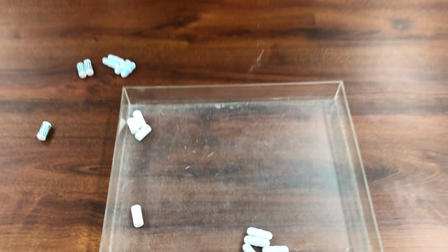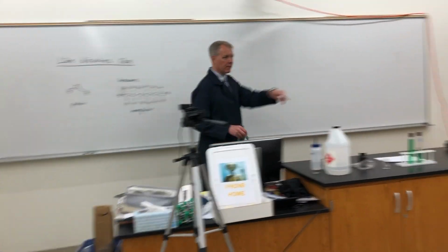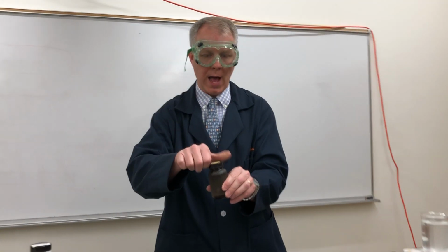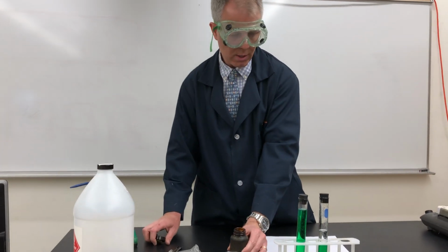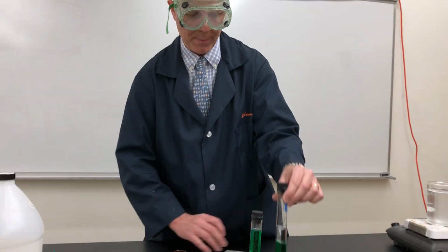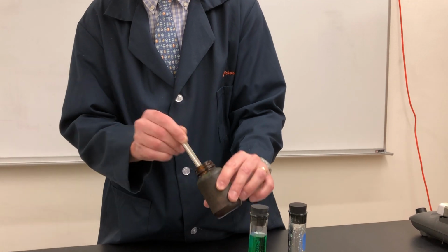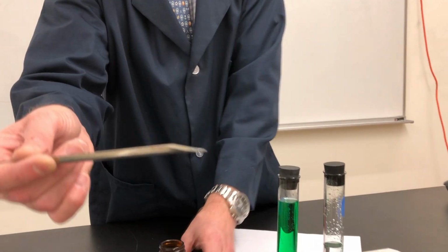All right, so one last thing to try over here. I have here a bottle of elemental iodine. I'm going to add this iodine to my hexane and water tube, and I want you to think about what's going to happen when I put iodine in there. If you need to, pause the video, take a moment and remind yourself of what the structure of iodine would be.